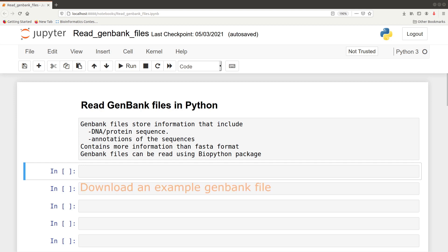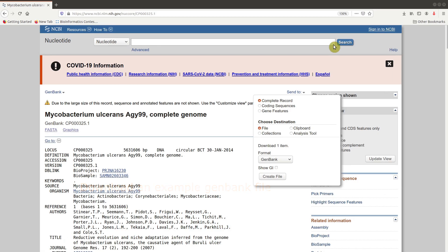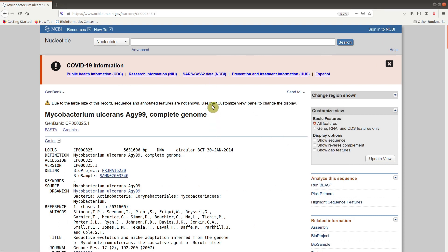Before we do that, we have to get a sample dataset. We'll visit the NCBI database to download the genome we'll use. This is the download page of the organism we are going to use — a bacterial species — and we are going to use its complete genome as an example for this tutorial.